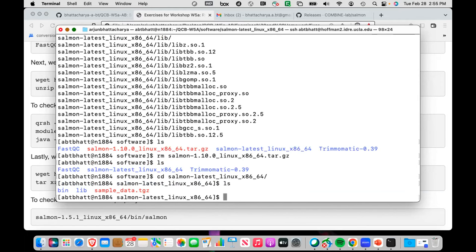Has everyone extracted? You can use mv, the move command, which is always to from. Oh, I'm sorry, from to. So move from here to this. Or alternatively, it's pretty quick to download, so you can remove and then download again. So again, even with wget commands, always know where you are in your file structure, so you can avoid having to move files later on.